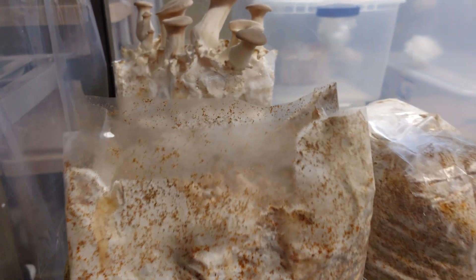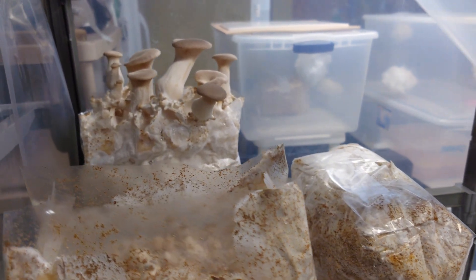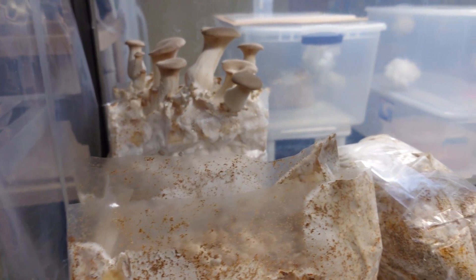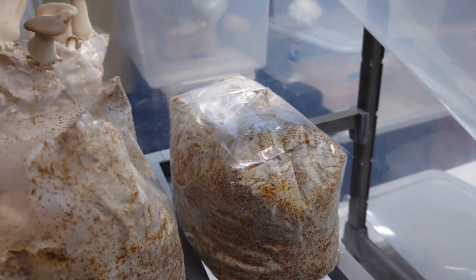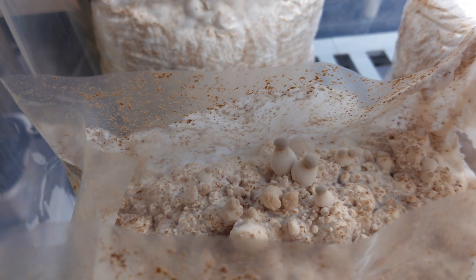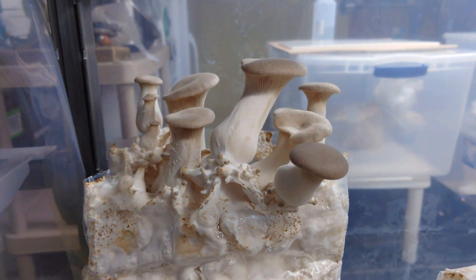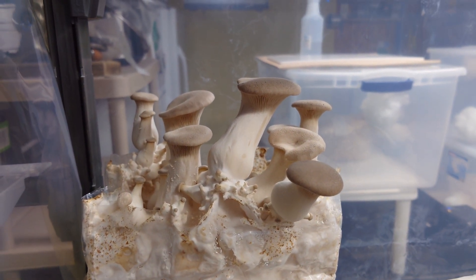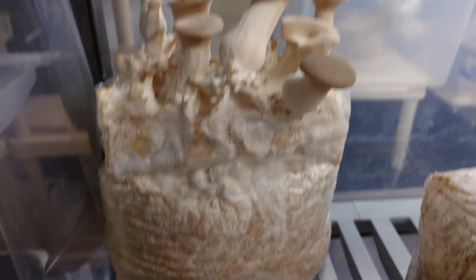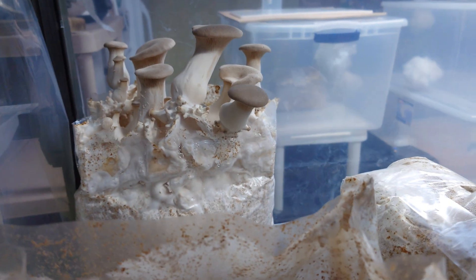Time for a quick update on our Asian market kings. I have three blocks currently in my automated humidity chamber running at 87% humidity. All our agar plates were clean. Took some wedges, dropped them to grain — all the grain spawn was clean. I also took some wedges and dropped them to LC so I can use LC with this strain from now on. We have one almost ready to pick, looking really nice, and one that is just pinning. What I'm seeing is what I'm used to with kings — probably eight or so that are going to mature and the rest are going to abort.